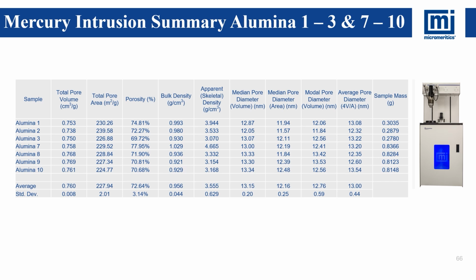Now you'll see what happened to samples 1, 2, and 3, why they did not go for analysis by the GeoPyc. The mercury test is a destructive test, but so is the GeoPyc. It leaves the sample slightly contaminated with the flowing powder.